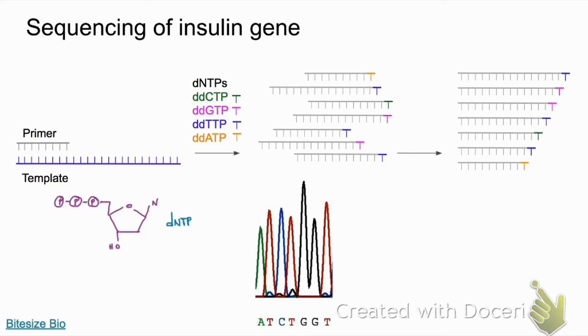Normally, in DNA polymerization, we use deoxynucleotide triphosphates, and so here's an example of that. And as we've talked about before, these deoxynucleotide triphosphates are defined by this hydroxyl group at the 3' carbon. This creates the location where phosphates are going to attach to this sugar. However, dideoxynucleotides lack this OH group and instead just have a hydrogen. These dideoxy or ddNTPs are called chain-terminating nucleotides because nothing can be attached to them.